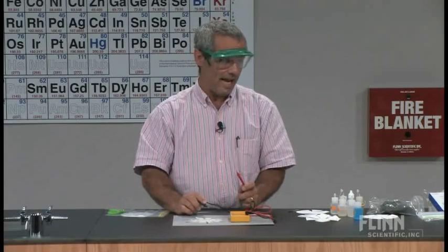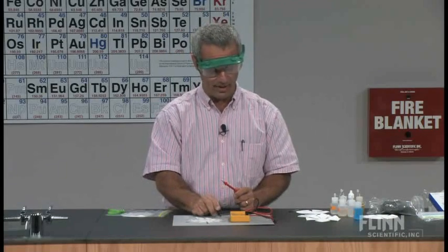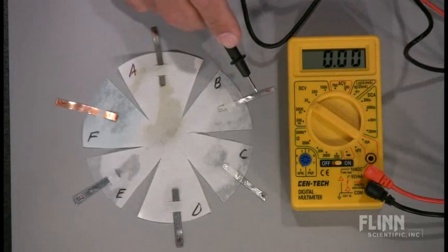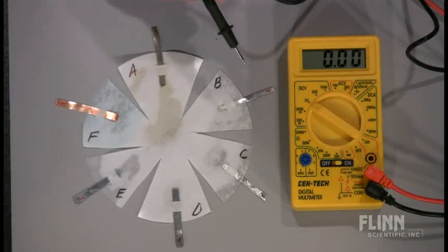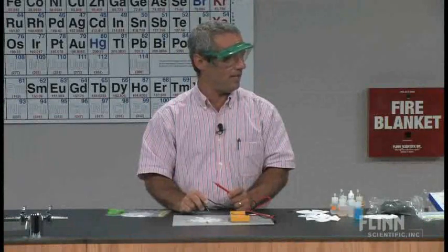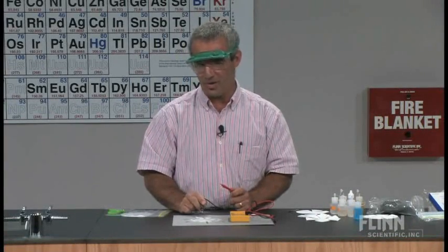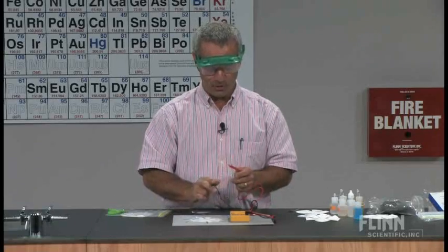Now I could then, and I have the students do this, they continue, then they put the one here on B and go around like that. I really don't need to do that. I can figure out which is which just based on all the competitions with A, because this told me not just which one won, but by how much it won, right?